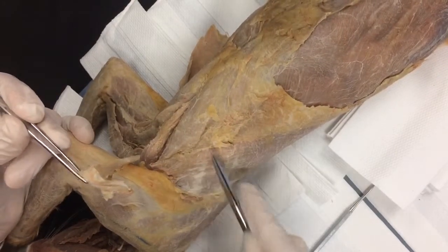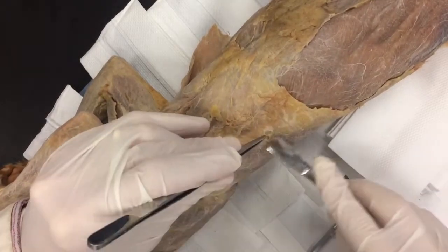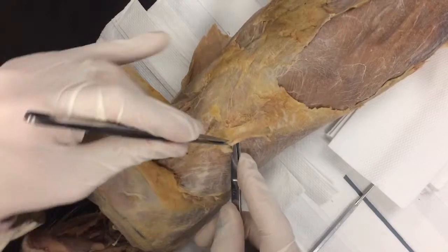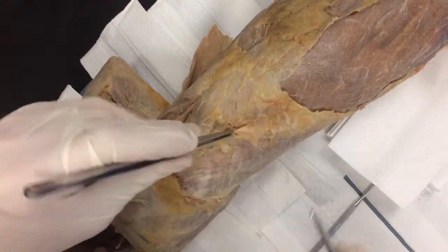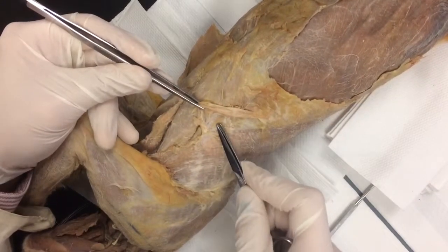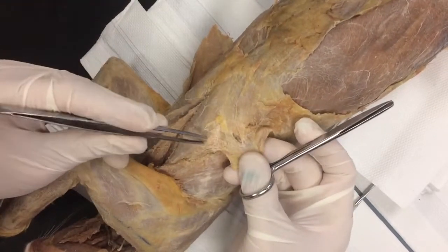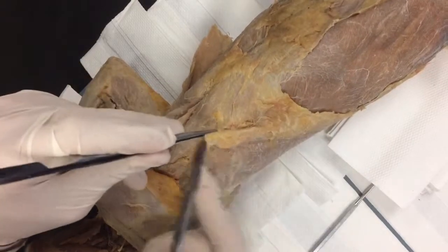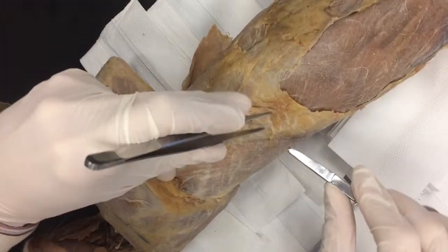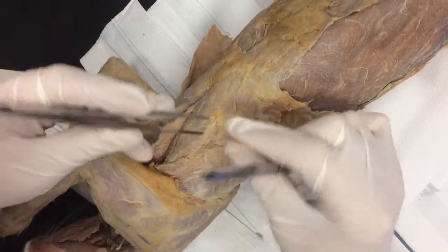Now you can definitely see the edge of latissimus dorsi. I'm going to continue back here — you cannot do this dissection until this skin muscle is removed. It has to be removed, because if you don't, you'll never see xiphihumeralis. It's all interconnected in here, so we're going to be really careful with scissor work. See those fibers right there? That's xiphihumeralis — we want to save those. I'm just going to put a little pressure, and you can see those are attached right there. It should just flake right off the edge.